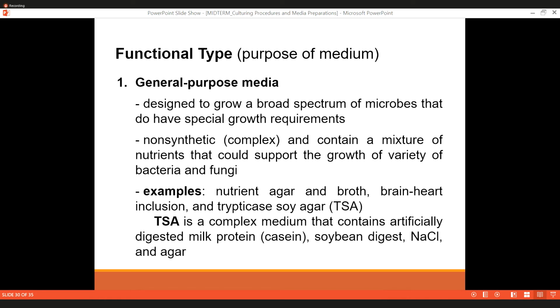So, doon ko siya na-purchase and then I need to also get help from our laboratory stockroom. Kaya na sila regulation. So it needs to, kailangan siya i-pass by pa sa customs, sa lab, mag-inform ka sa lab, kaya medyo yun siya, very sensitive na chemical.